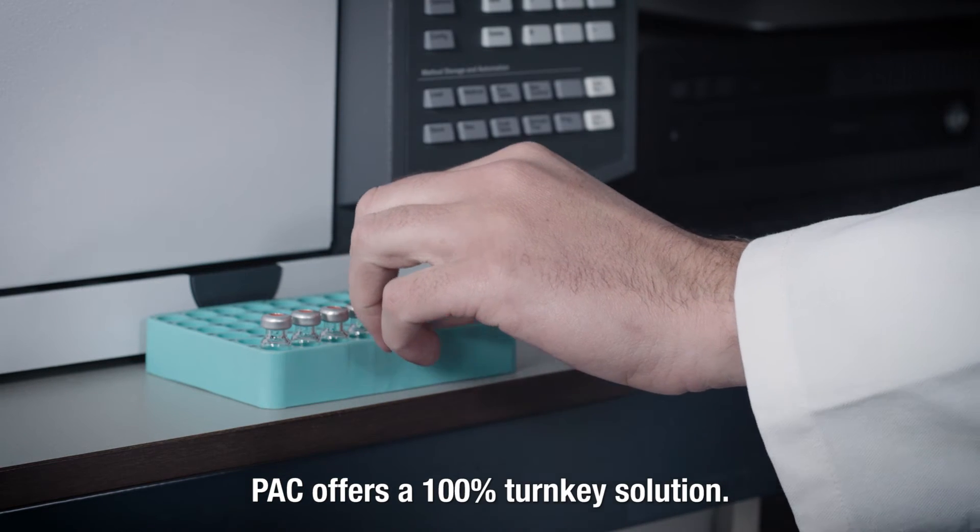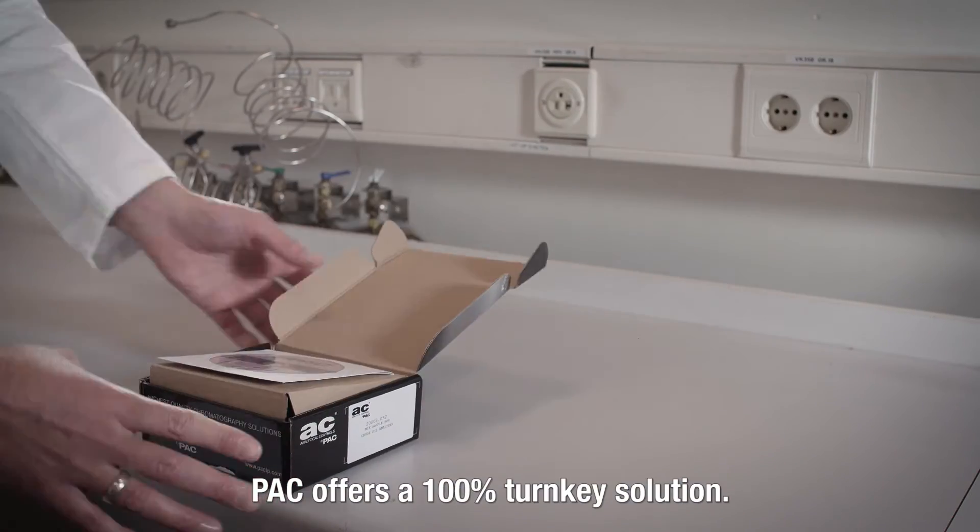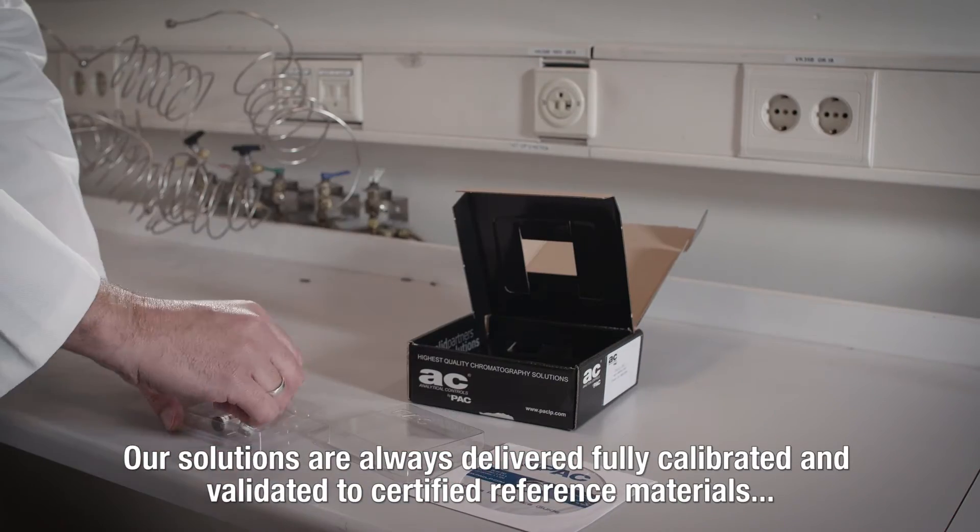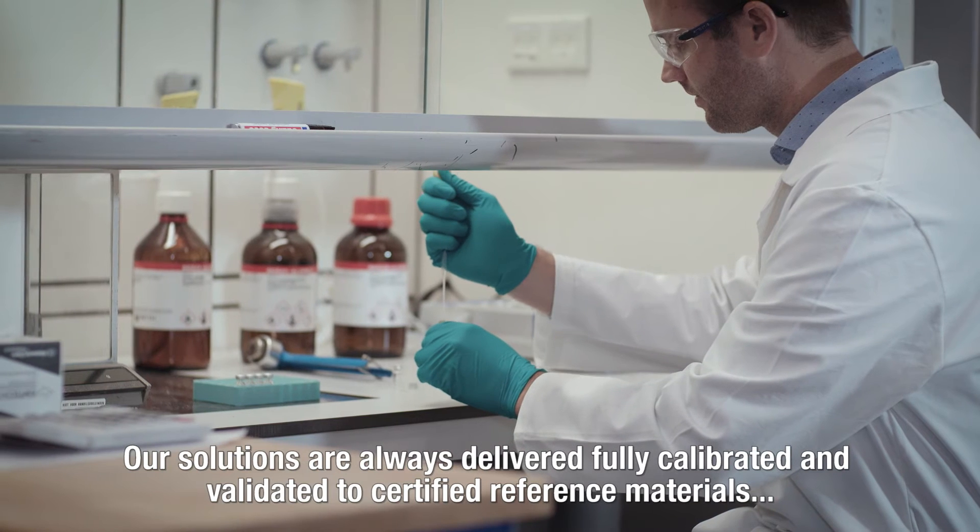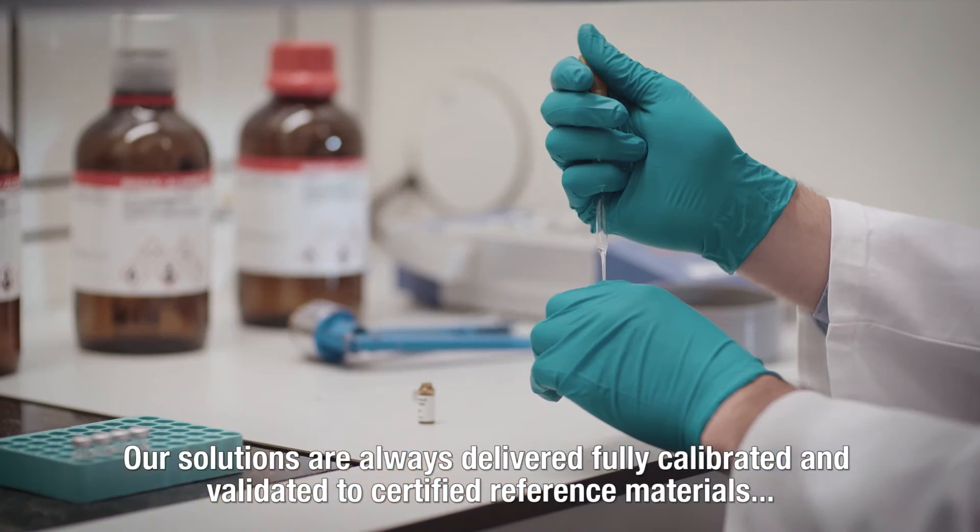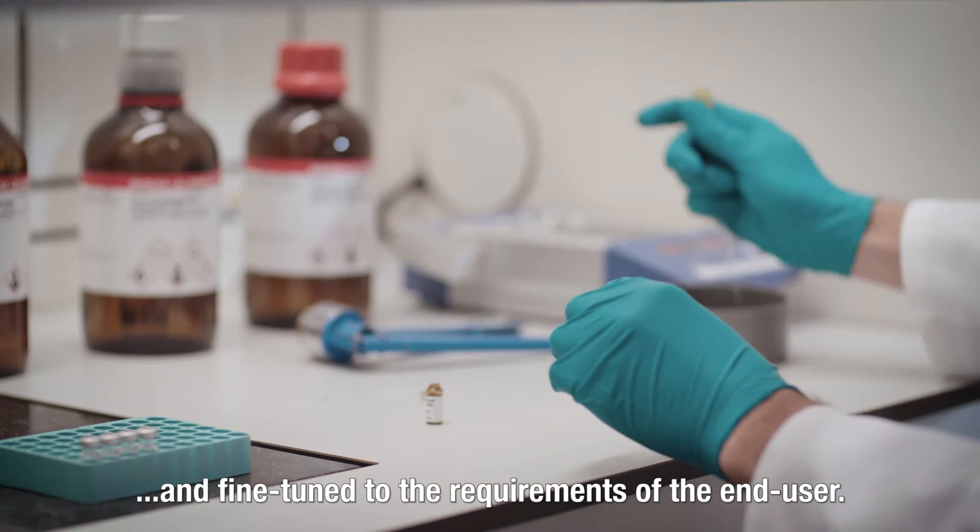PAC offers a 100% turnkey solution. Our solutions are always delivered fully calibrated and validated to certified reference materials and fine-tuned to the requirements of the end-user.